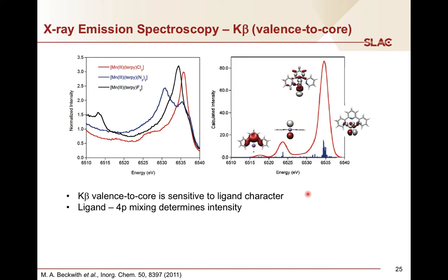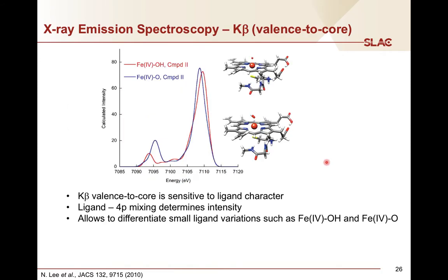And that gives you the opportunity to look at the orbitals. And what you find is that the double primed is indeed the ligand 2s orbitals. And you're mostly sensitive here to the ligands rather than the metal ion, but the ligands that mix into the metal. And potentially this is a very powerful method because it is very sensitive even to very small changes.